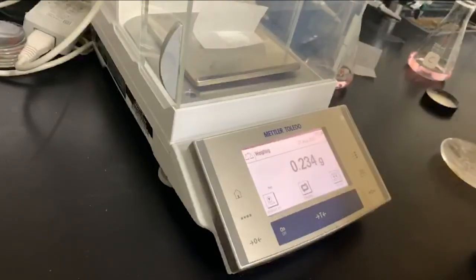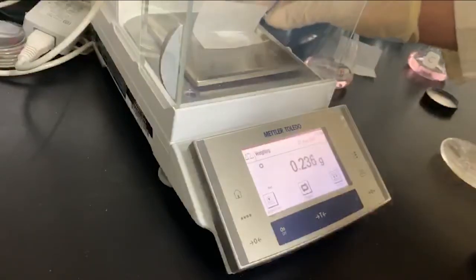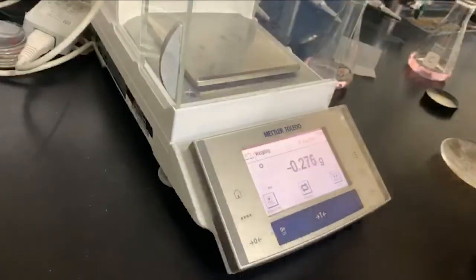Okay, record your value. And then we'll put that in the Erlenmeyer flask marked C.